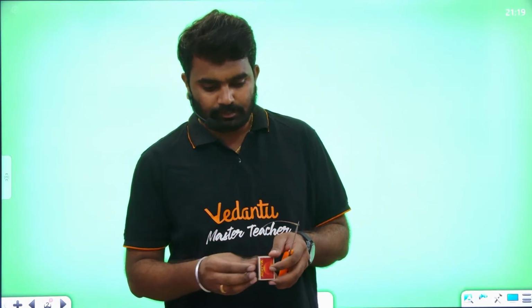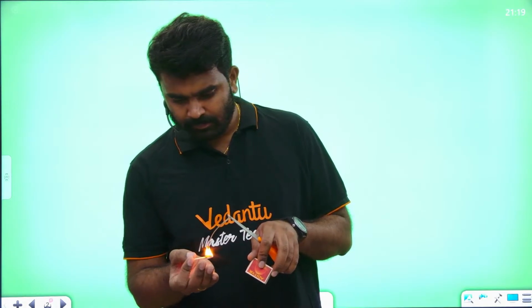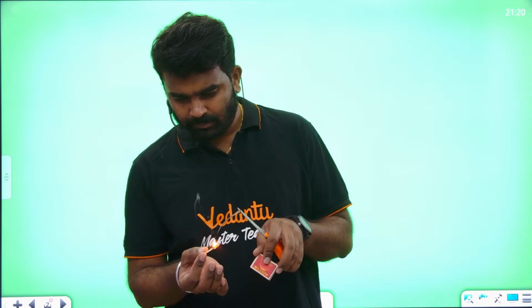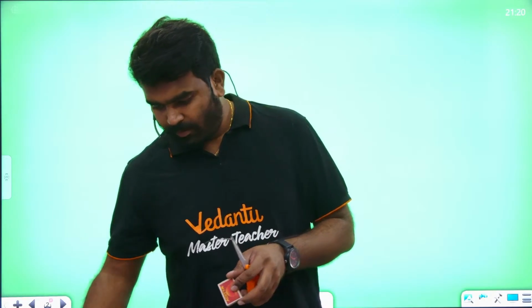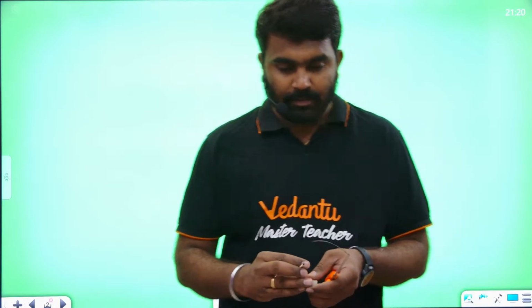Good evening, John. Okay, what I am doing now, I will be burning this magnesium ribbon. Oh my God, maybe it required a candle, but I don't have a candle right now, but I'll try.